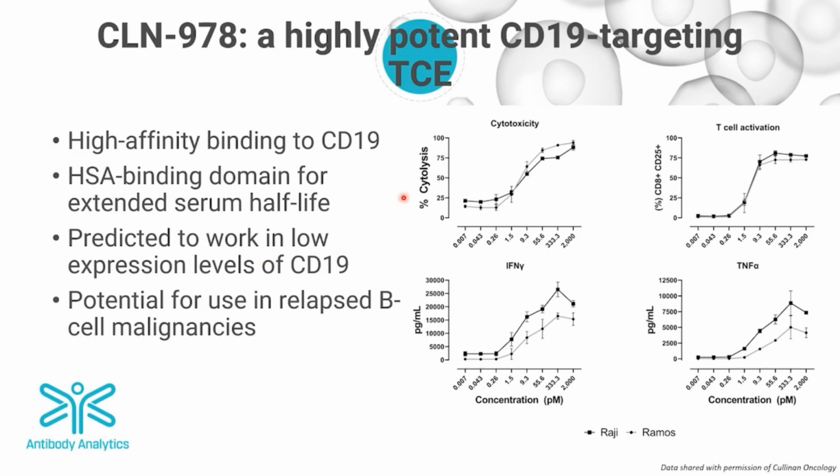effective at low concentrations in terms of cytolysis of target cells, interferon gamma, TNF-alpha production, and T-cell activation as measured by CD8 and CD25 positivity. This therapeutic has the potential for use in relapsed B-cell malignancies where there has been CD19 antigen loss.